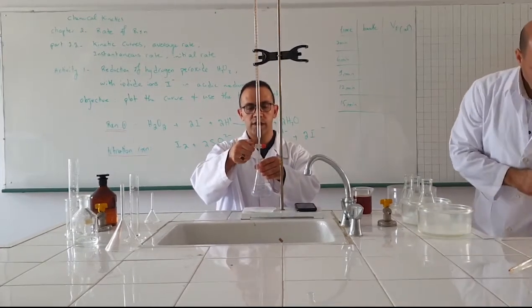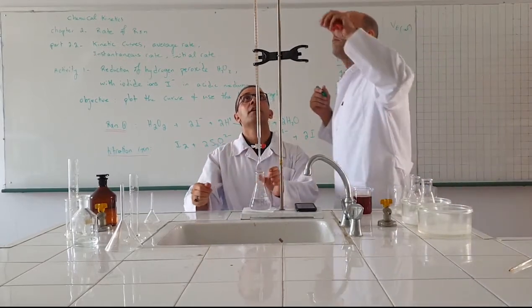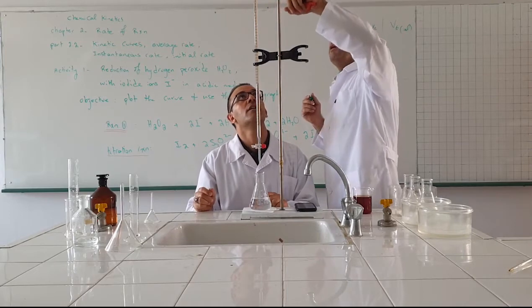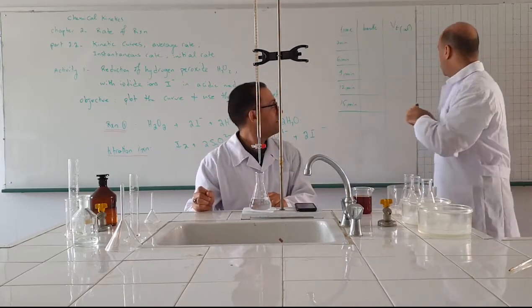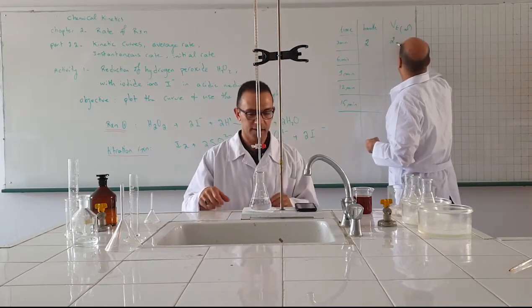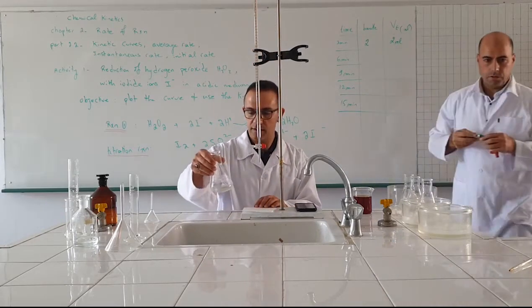Now, the solution is decolorized, meaning that equivalence is reached. The volume or the reading of the burette is 2 milliliters. So, the volume is 2 milliliters.